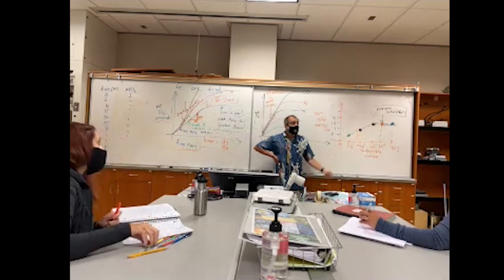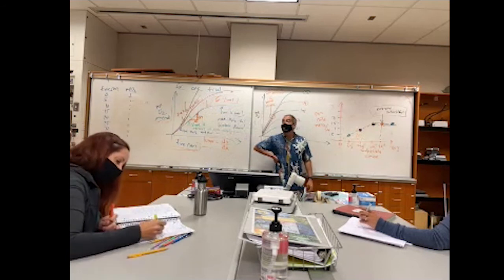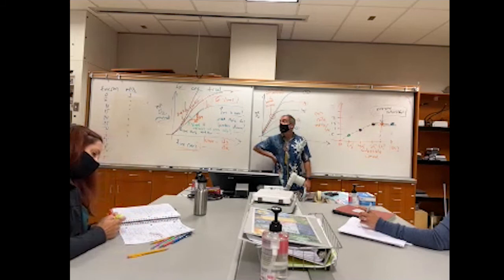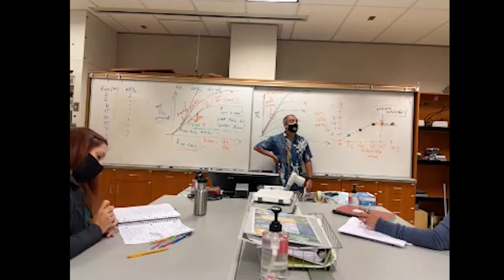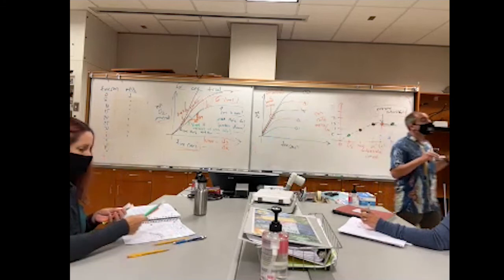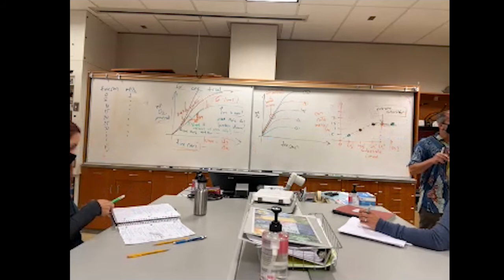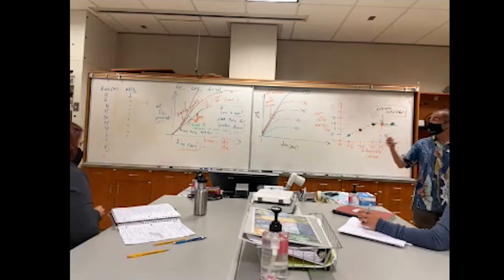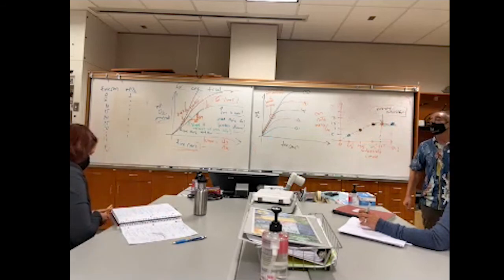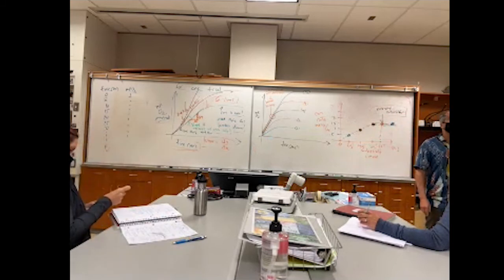So next class, I'll be spending more details, working with you all to make sure you can do this and feel comfortable. But what we're going to do today is get our data. We're going to do the same reaction 6 different times, probably more than that if you mess one up. Not that tricky to mess them up.